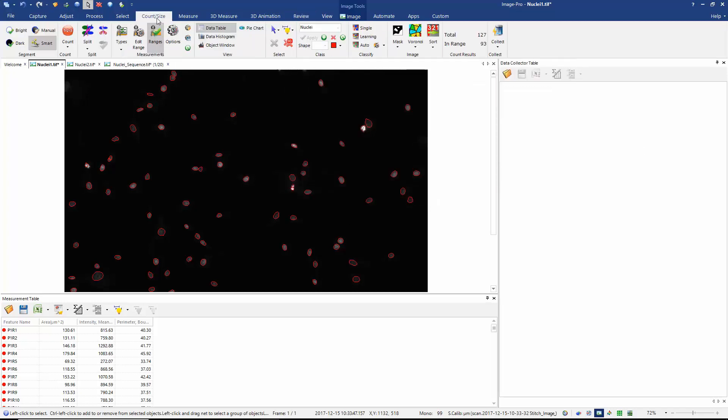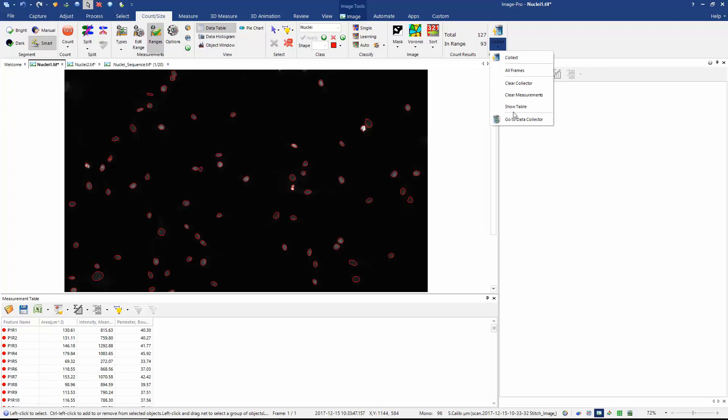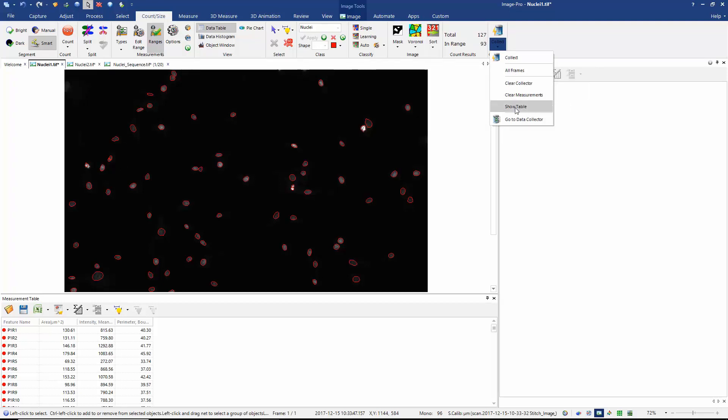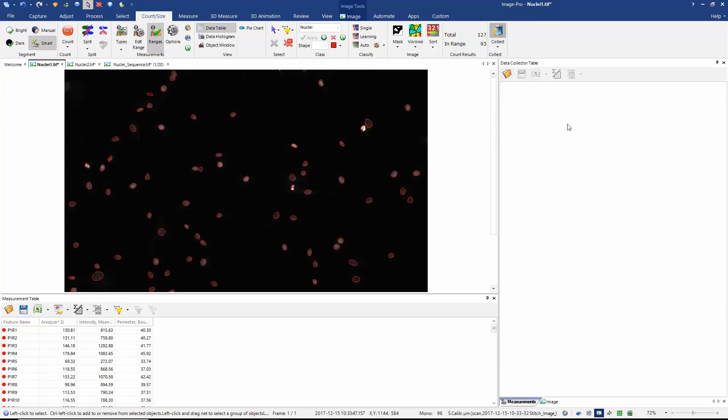If I go back to the count size tab and let's first check my options for my data collector. I have deselected the option to measure all frames, to clear the collector, to clear the measurements table, and to show the table. All I'm going to do is click collect and here we can see effectively a copy of the measurements we have in our measurements table.